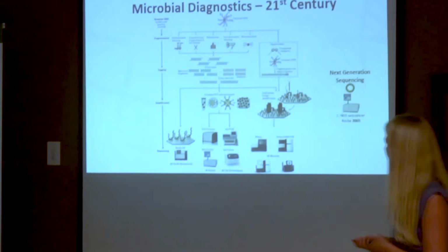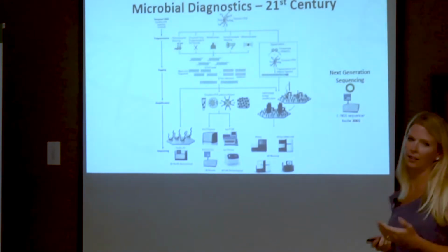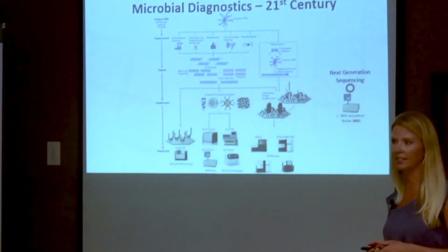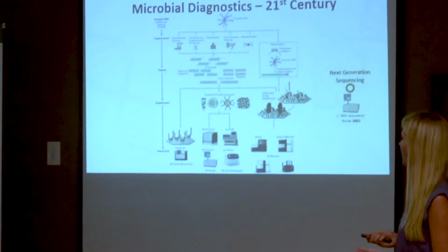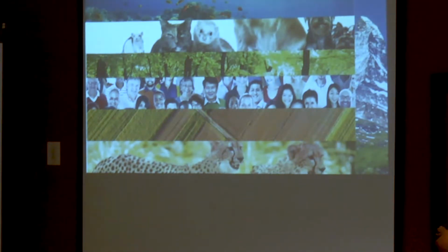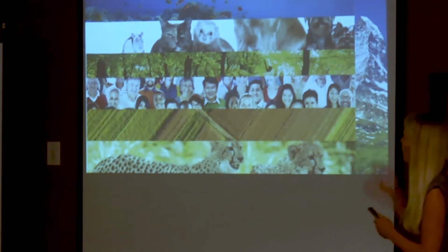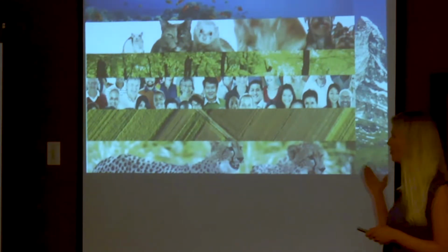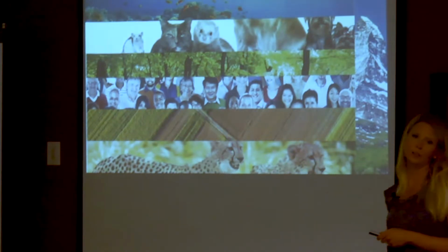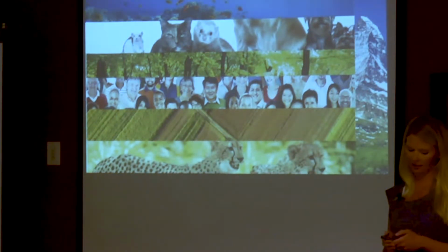And there are a few companies out there that are selling this. One of them you might know is Illumina. They're located close to us in San Diego. So it's a very standardized technique that's used by scientists on all kinds of samples, from the oceans to our pets, to forests, to ourselves, in agriculture, wildlife, and highest points of Earth on the Himalayas.